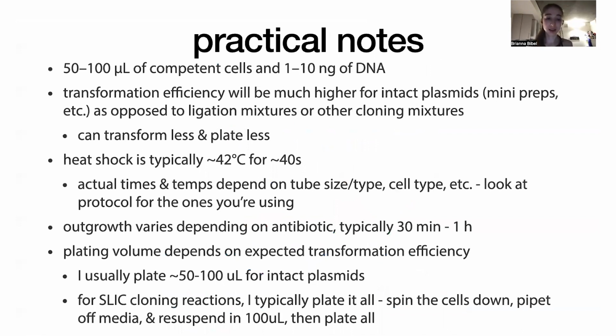And again, the exact details are going to depend on the type of cells that you're using, the type of DNA that you're transforming, the type of tubes that you're using. So there are a lot of different things, and it's important to look at the actual protocols for the cells and the tubes that you're using. But this is just a general overview of the technique, as well as some typical parameters for when you're doing this.